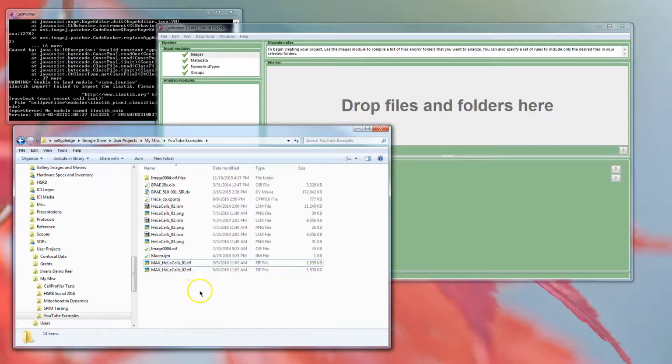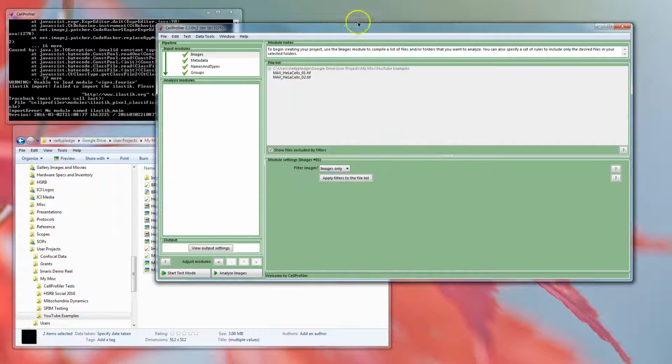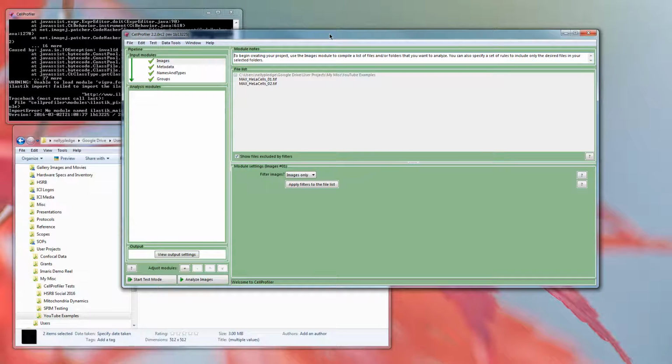I'm going to start with a couple of images here in my folder for playing around with, and these files I've projected in the Z direction. Generally I don't work with 3D stuff in CellProfiler as much. You can do it, it will go through each individual Z and you can group them together, and it adds another layer of complication at times. Most of the time when you're dealing with cells that are on the cover slip, the Z information is not as relevant to a lot of experiments, and you can take a Z stack and project it down and look at the size of the shape and the distribution just in X, Y a lot of the times.